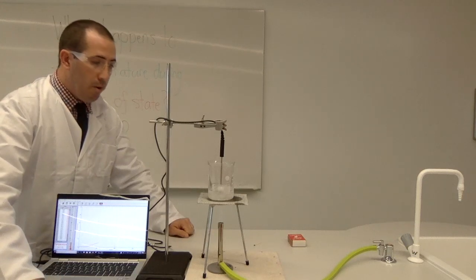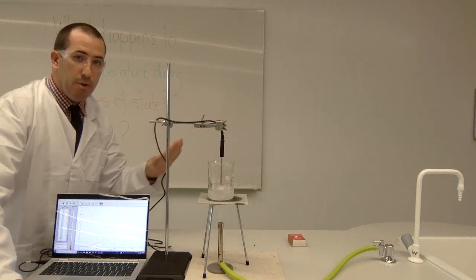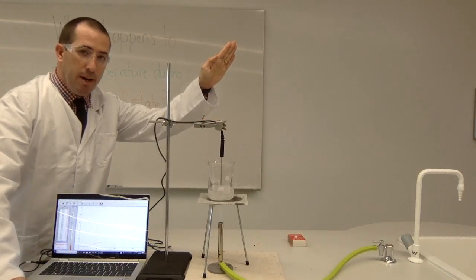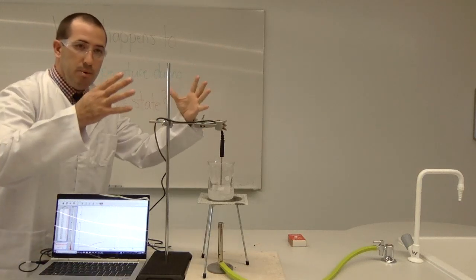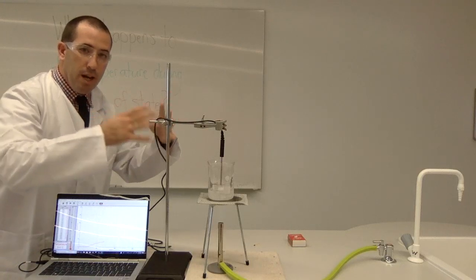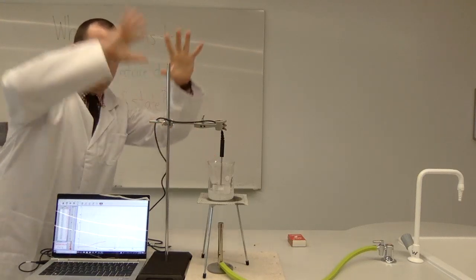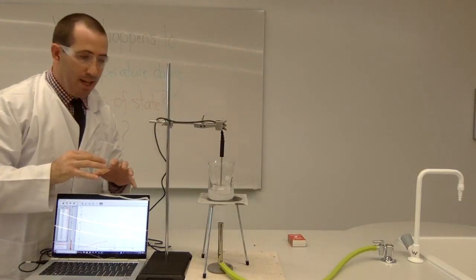Now, as the liquid water gets heated up, the temperature is obviously going to rise. Now we're going to see what happens when the liquid starts to become a gas. So what's going to happen to the energy of liquid particles as they go from a liquid state to a gaseous state? Let's see what magic we can see here.